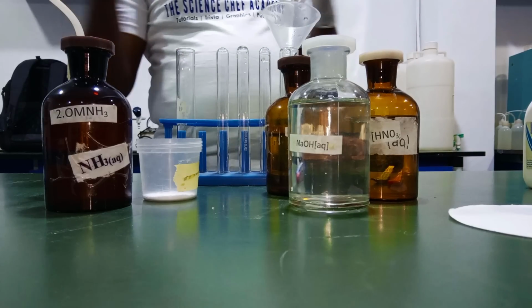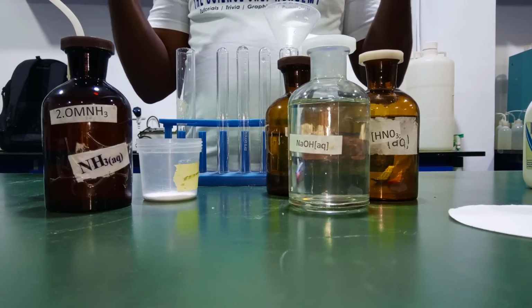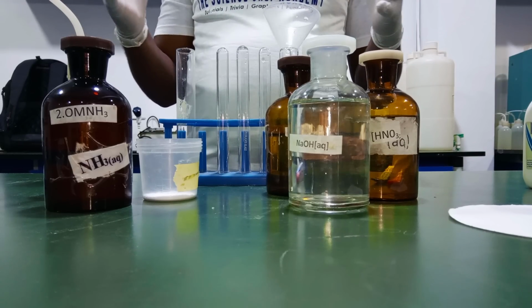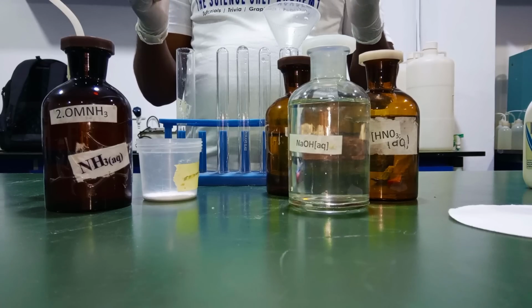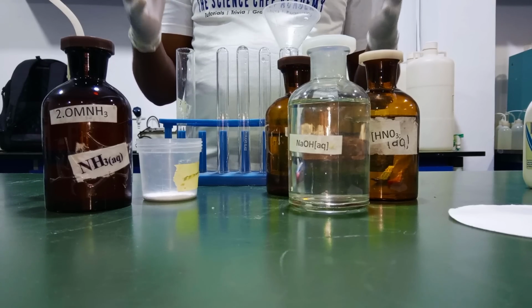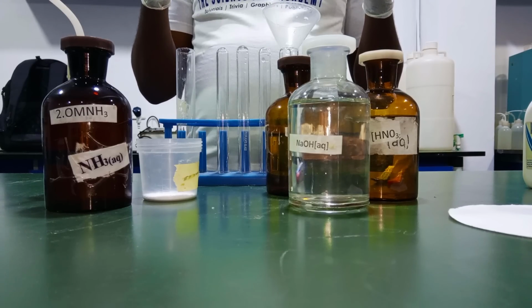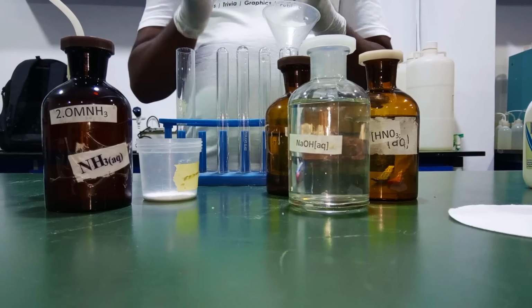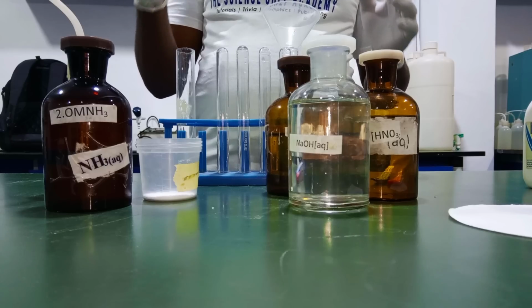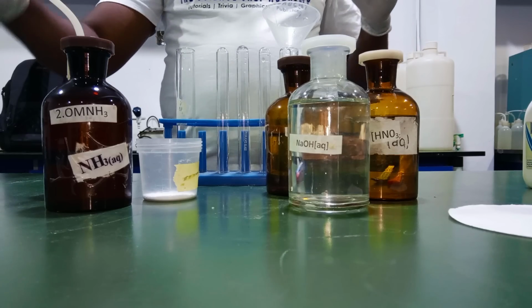Now, given there is a mixture of two salts, it's likely that, from the last video, we showed you that the reaction is a double decomposition precipitation reaction in which the lead(II) trioxonitrate(V) and the sodium trioxocarbonate(IV) will combine to form insoluble lead(II) trioxocarbonate(IV). So we are going to take a sample of that.